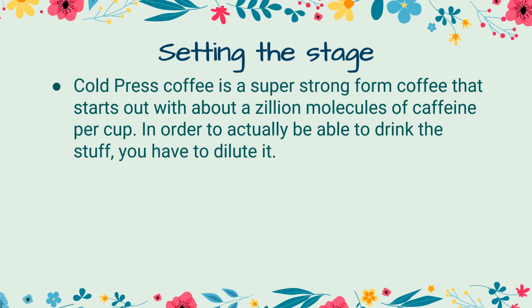So, of course, lots of things can be diluted, not just blood samples or bacterial samples. We can do something every day. So here's an everyday scenario, and it's cold coffee. Cold pressed coffee is a super concentrated, strong form of coffee that starts out with a zillion molecules of caffeine per cup. In order to actually be able to drink the stuff, you have to dilute it or your heart explodes.